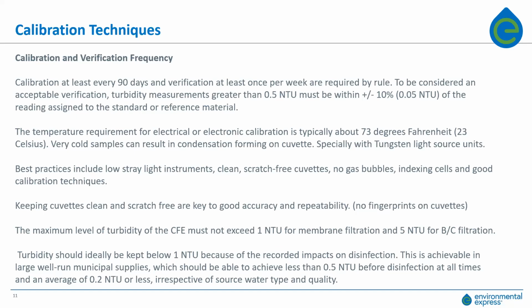And this is especially true with the white light tungsten light source, as I mentioned. You won't see this as much with the LED because they don't produce nearly the same amount of heat. Now, normally with water treatment plants, the temperature of the incoming flow is very stable, changing a half a degree or a degree over a month's time.